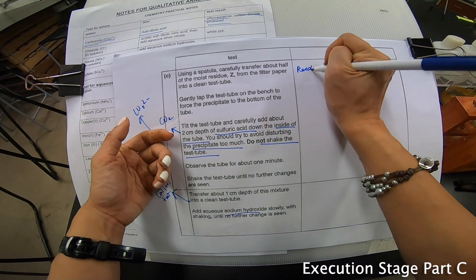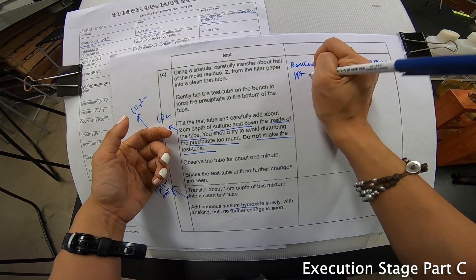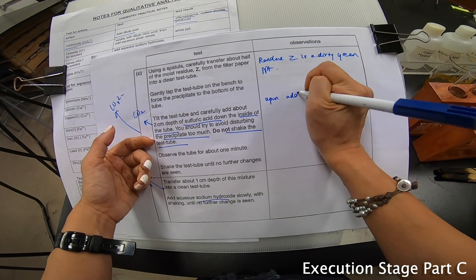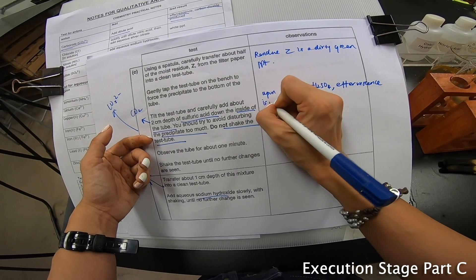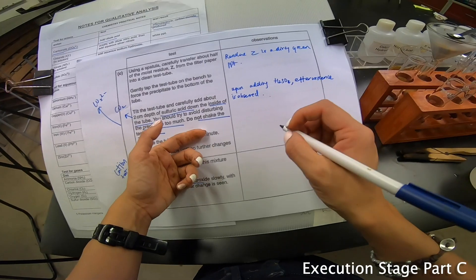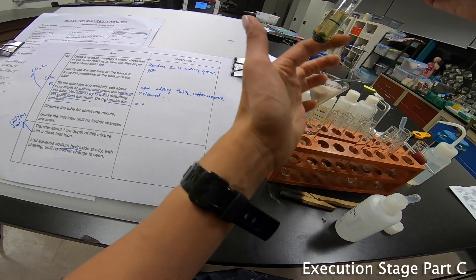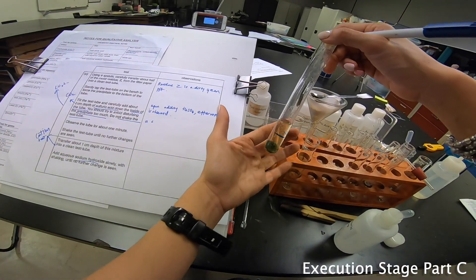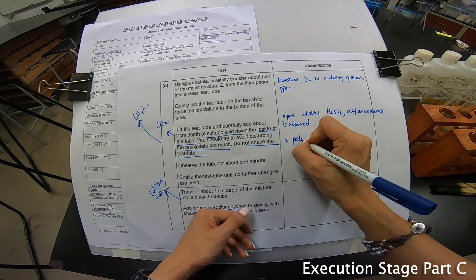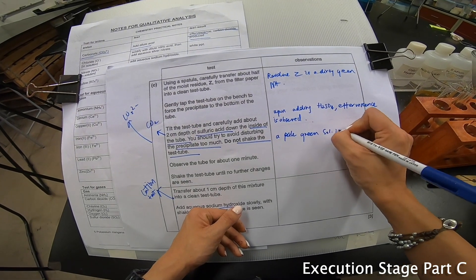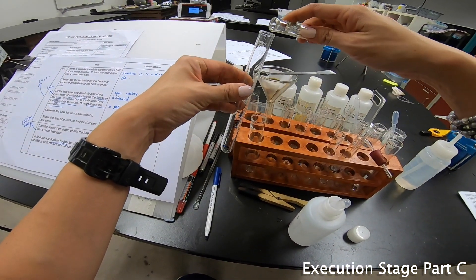Now over here I can say that residue Z is a dirty green precipitate. Upon adding H2SO4, effervescence is observed. I did not shake the test tube. Over here I can see that the solution on top of it is a slightly pale green solution. So I'm going to write down a pale green solution is observed. I'm going to go on to pour this out, the solution out.